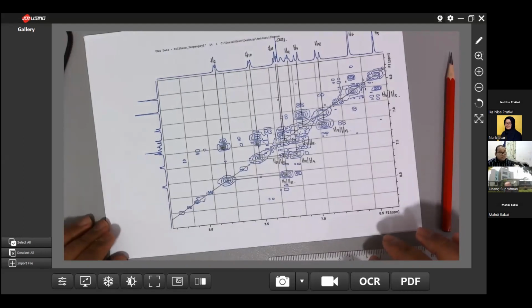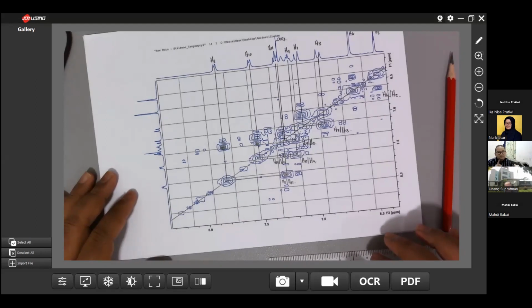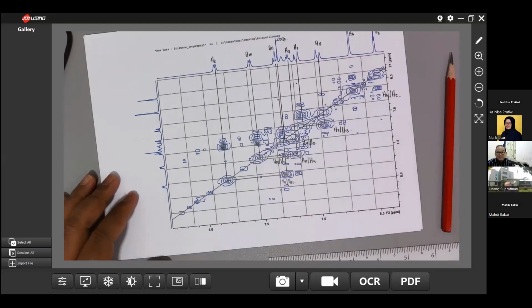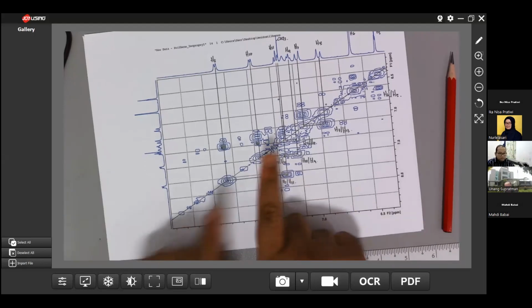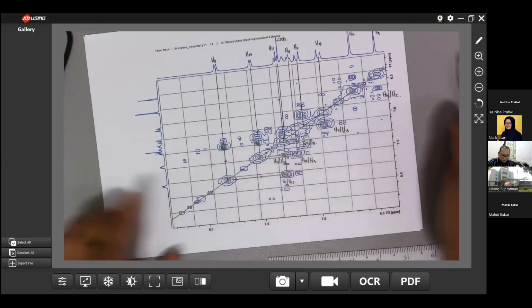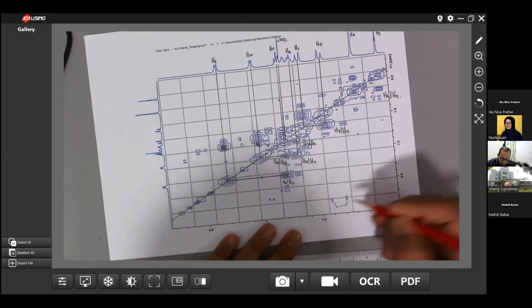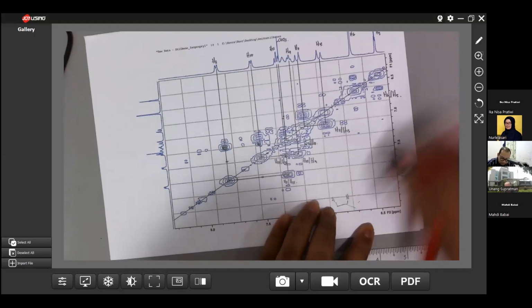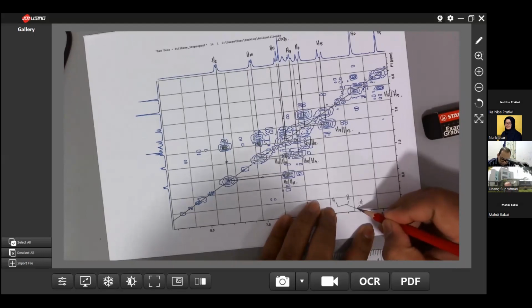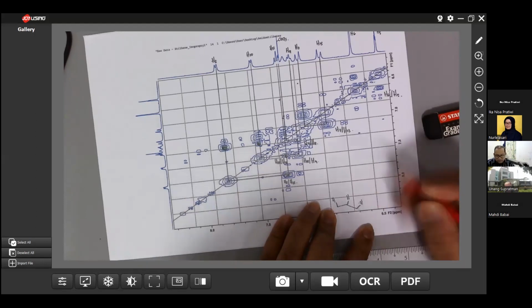The thing that is not really good for the NMR is that if you use a higher frequency, sometimes they can jump to another neighborhood. That's why sometimes, instead of neighboring protons, they can see another neighboring proton, for example like this H. If you have 400 megahertz, it's good enough.